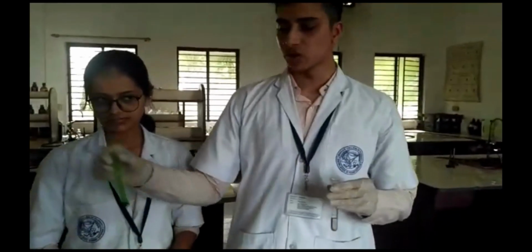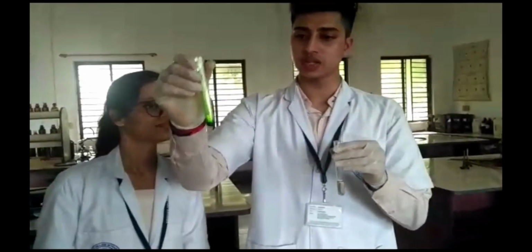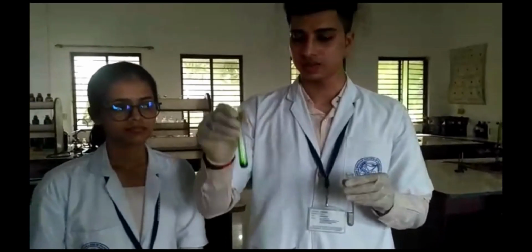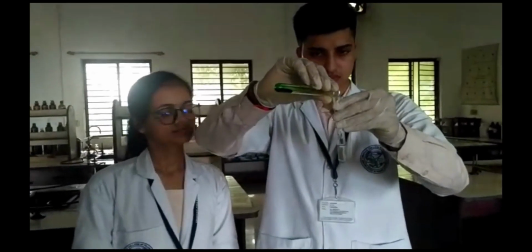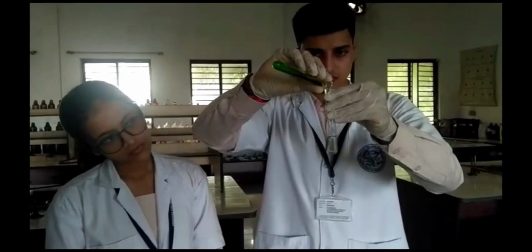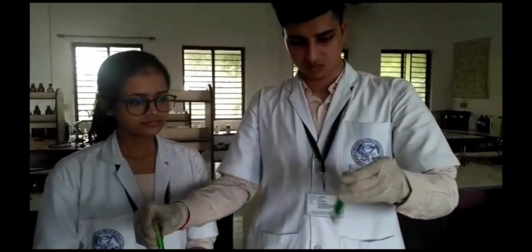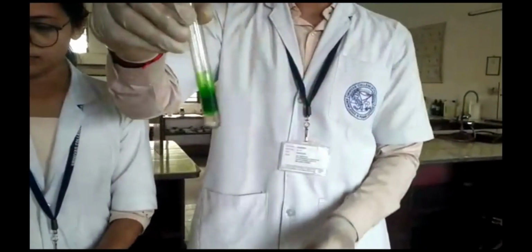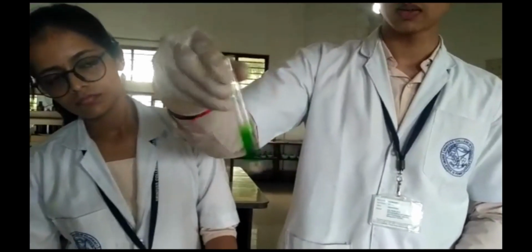To the glycerine, I am adding chromium sulfate. The chromium sulfate is prepared from potassium dichromate and sulfuric acid by mixing it with methanol. I am giving a little shake so that the green color spreads all over the glycerine.